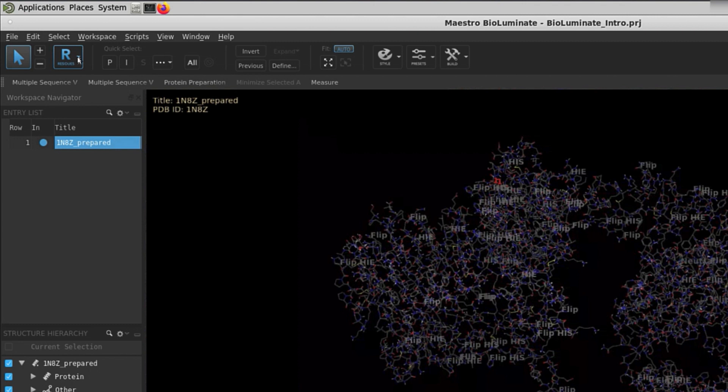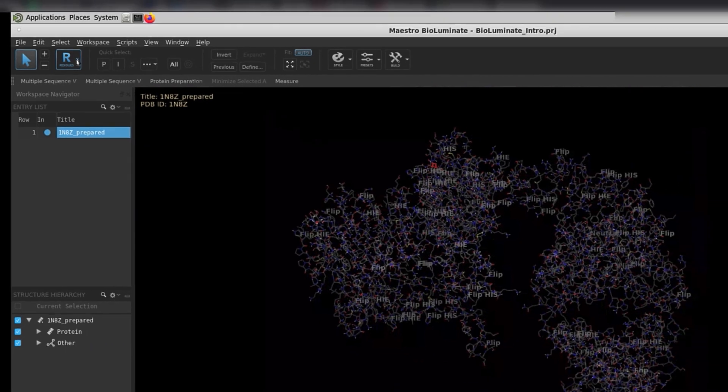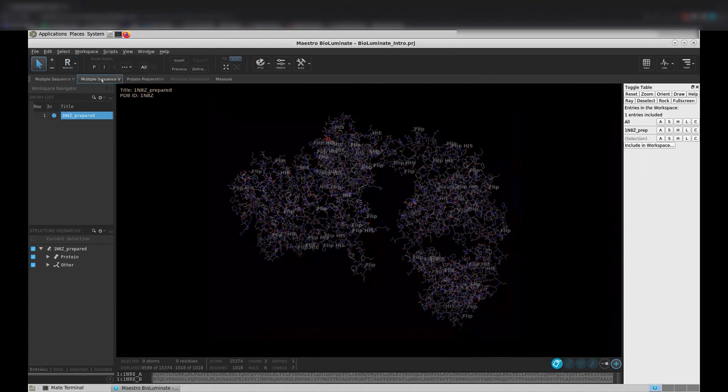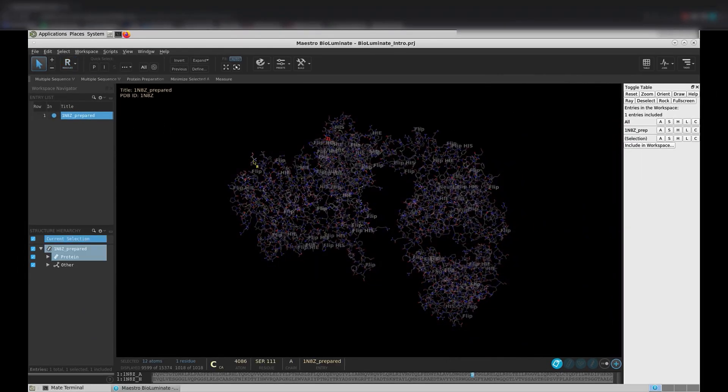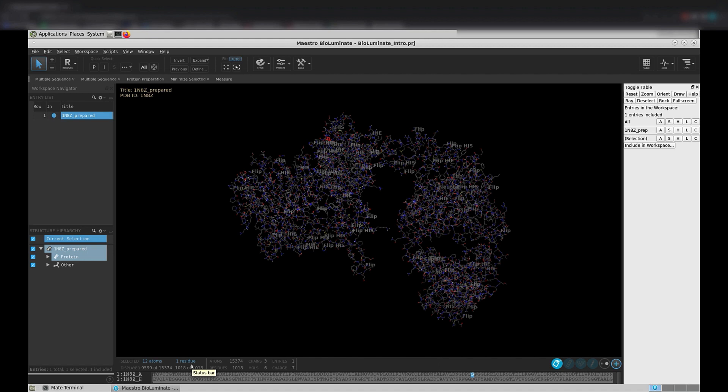It is important to know that BioLuminate works on a select first paradigm. That means that if you want to change the look of a molecule in the workspace, or you want to modify part of a molecule, you first need to select those atoms within the workspace. Let's select a residue in the workspace. If we look down at our status bar at the bottom of the BioLuminate interface, you can see we have one residue selected. You can also select the whole chain by double-clicking the residue.